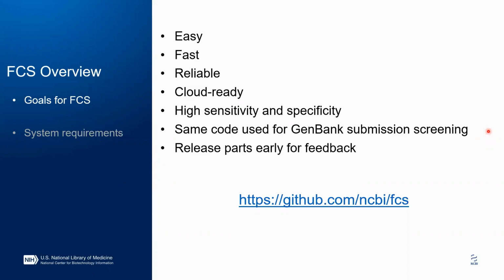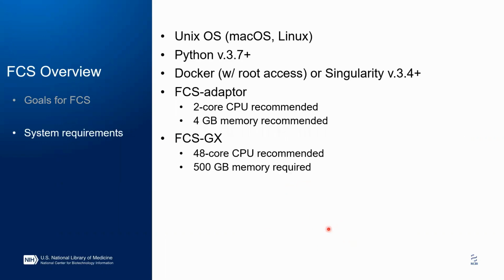We've released components of FCS and have received user feedback on our releases. We've also released new software releases that have addressed some user requests. And here's the HTML link to the FCS GitHub page, which we will visit as part of the live demo.